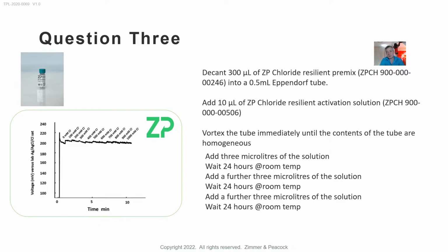What I mean by not optimized: to make a reference electrode and have to spend 72 hours doing it, in a real factory, we obviously run factories, you don't want to be doing this. So this is an okay starting point. The first line's about decanting the 300 microliters and the 10 microliters. Yeah, that makes this solution. And how you really deposit it and how long you really leave it to cure, I think I've said to them, look, that's something you're going to have to really optimize.